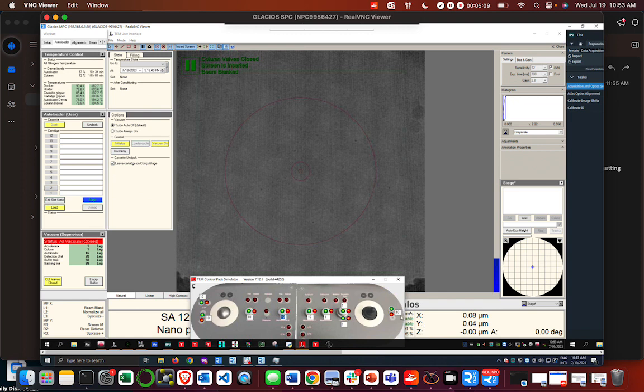And then we have a Z position, which we control over here. There is a Z height adjustment button, and we can control that there. And then we also have a stage tilt readout here, which is usually going to default to 0 degrees when you're screening. And then that's something that you'll adjust as you collect data if you need to.